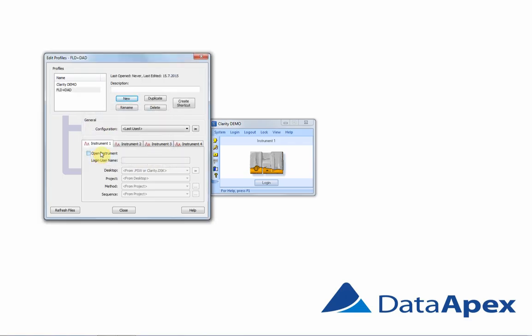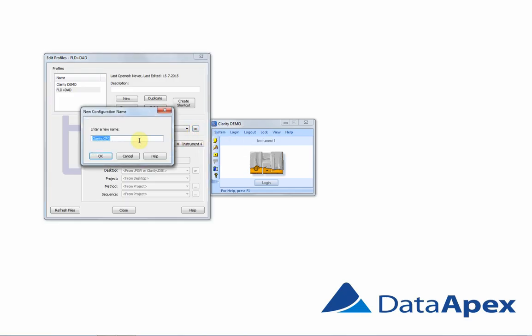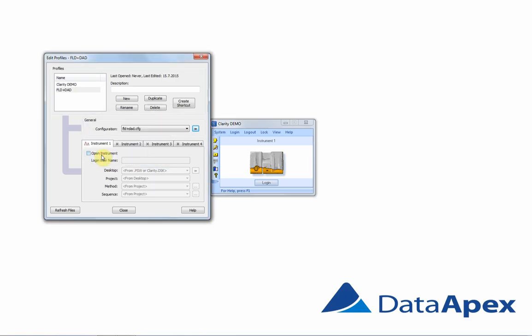Since it is already configured in the Clarity, we can use the configuration and duplicate it. In this way, we will preserve this setup from overwriting. I will rename it to FLD plus DAD and click OK. And this profile is completed.